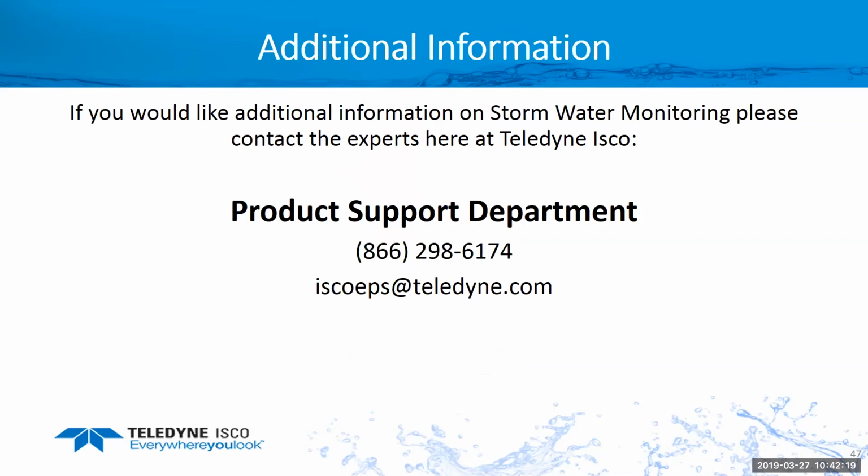Okay, so the next question is, we have Flowlink 5.1 on their computer. They also have a Flowlink 4 with an RTD. It's an older RTD. They want to know if the RTD is compatible with Flowlink 5.1 using the 700 module series. Yes, the RTD will plug into any of our samplers as far as the 6712, the Avalanche. It'll download the data. You can bring that back. Flowlink 5.1 still has the ability to speak to the RTD.